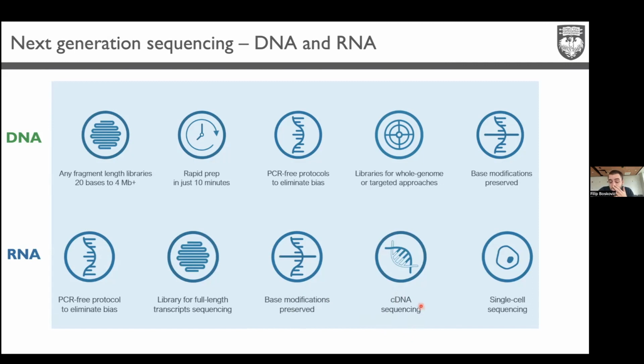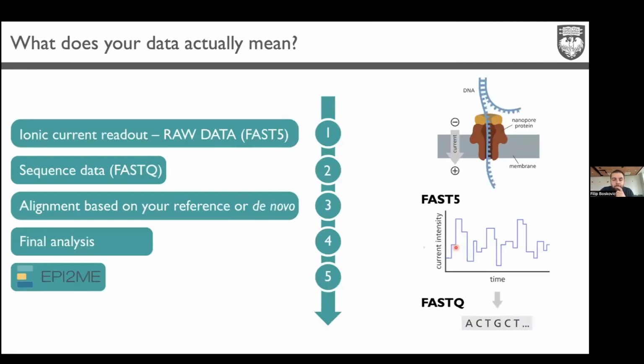You can also do cDNA sequencing. That kit was actually discontinued, though they didn't change that on the website. They had the option to sequence both RNA and cDNA of the same molecule, which of course increases accuracy, but now I think they don't have it anymore. Recently they also showed that you can do single cell sequencing combined with 10x Genomics. That I think the facility also has. So if you want to do single cell sequencing, I think you can now do everything within the core.